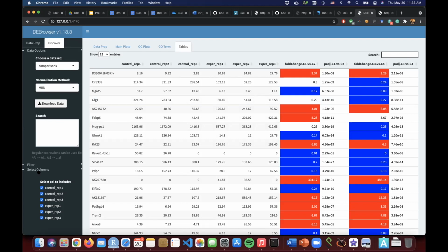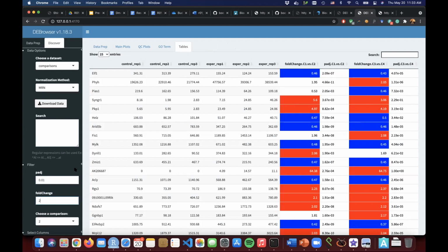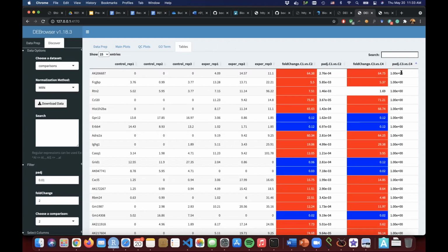In this case, my filtering is kind of low, but I'm going to make this normal, like the defaults. So I'll show you more examples here of how you can use these comparisons, and some of them are here. For example, in this case, when you have 3 replicas, it is significant.